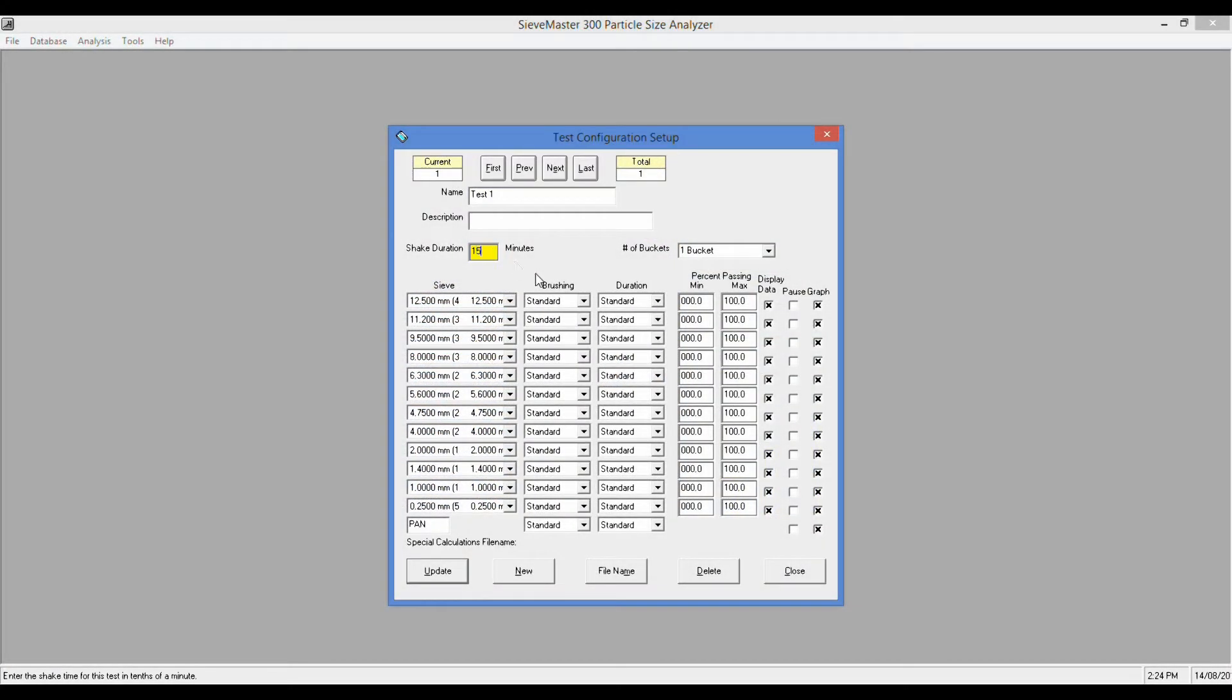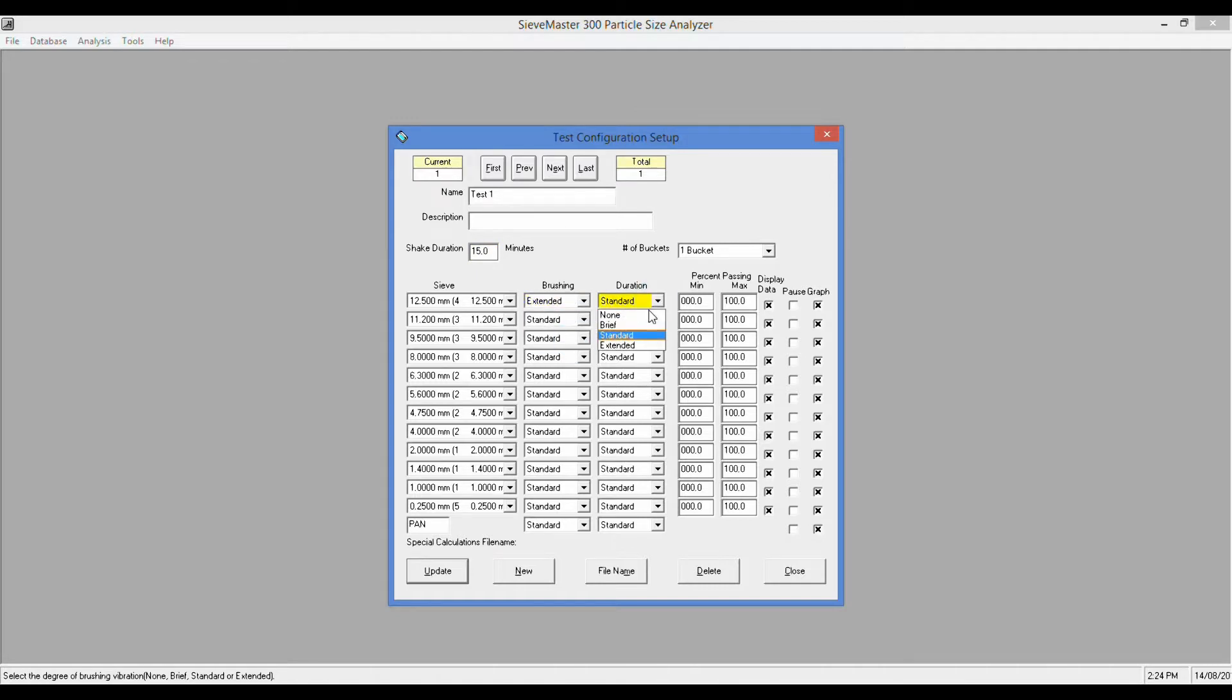Sieving duration along with brushing time and a host of other parameters are fully customizable and can be easily adjusted between tests.